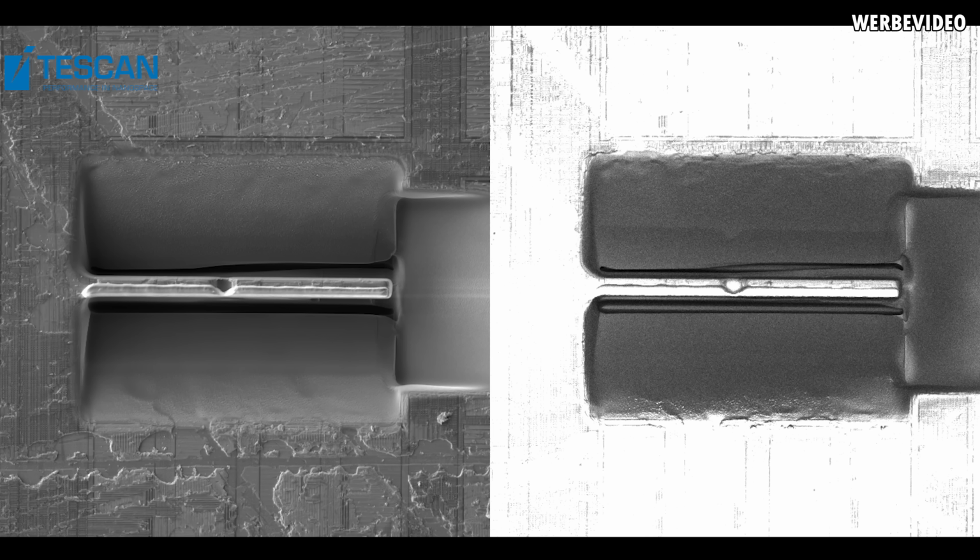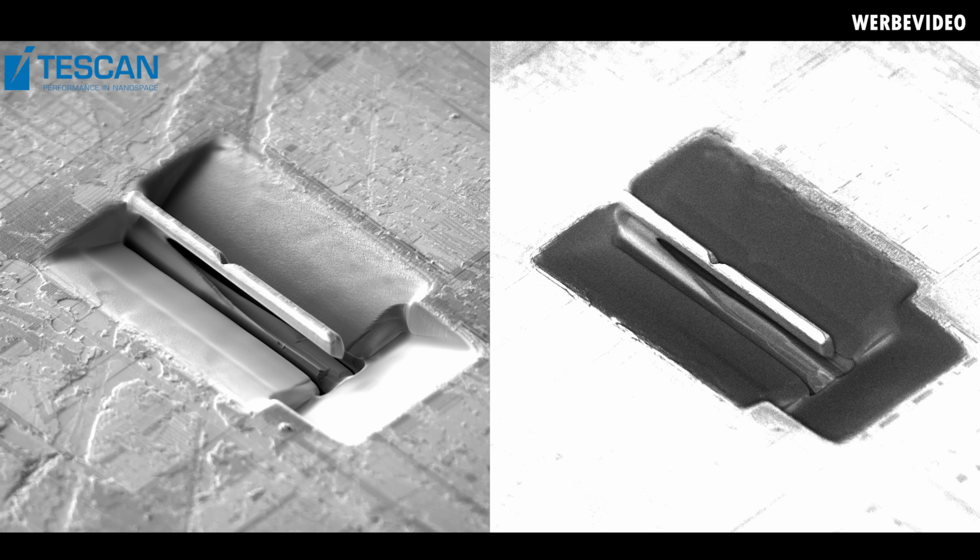Now after our successful milling, you can see on the images that we have cuts from the top and from the bottom and a small cut from the right. The cuts are performed with an angle, so we are cutting also underneath, and the lamella is just hanging on this very tiny piece on the left.